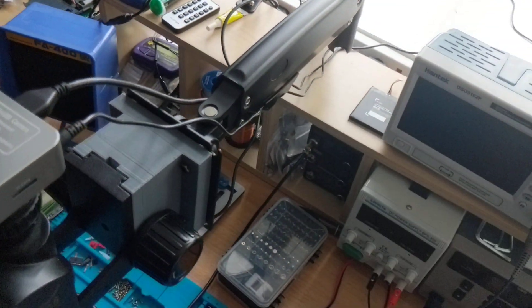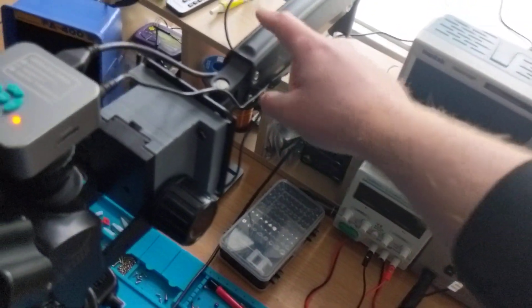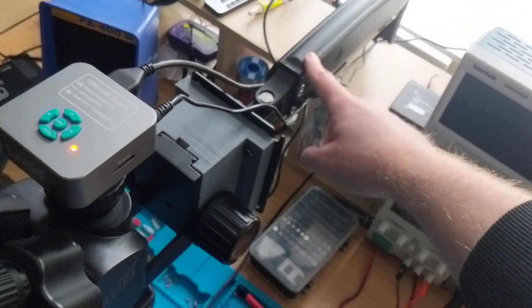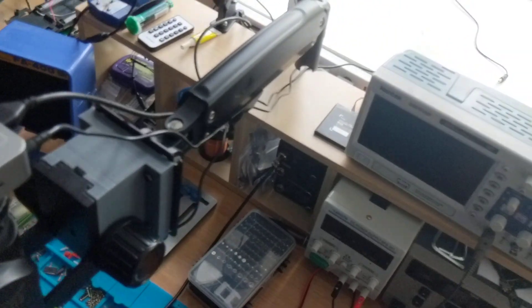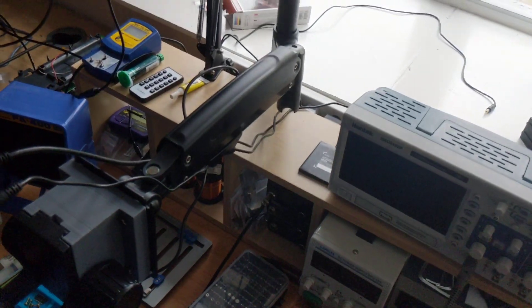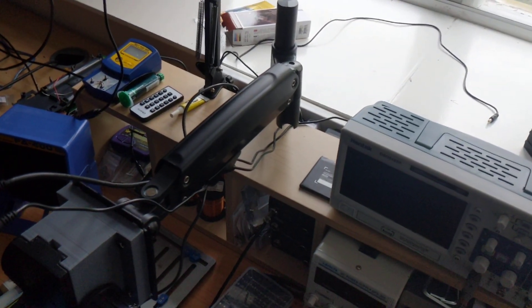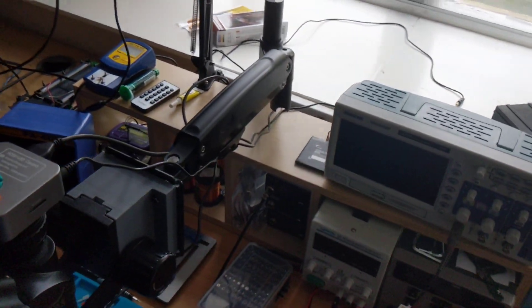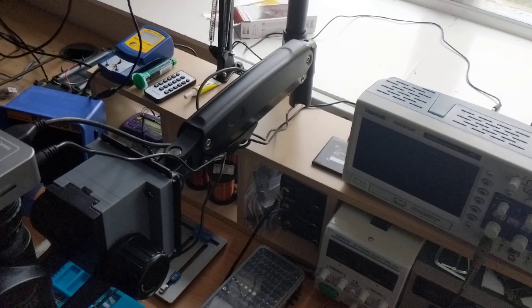You can print one of these and buy one of these arms for around about 30 UK pounds. I paid 27 pounds and 44 pence for this with next day delivery off of Amazon.